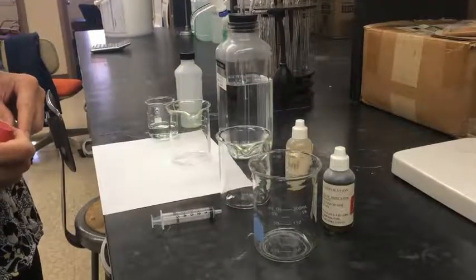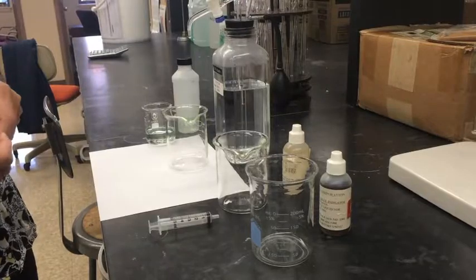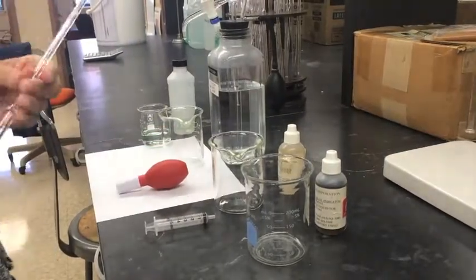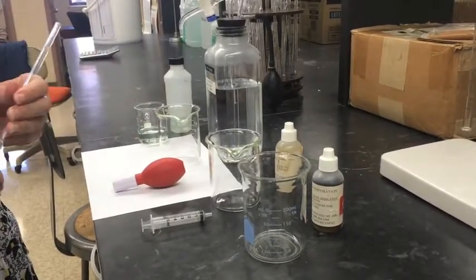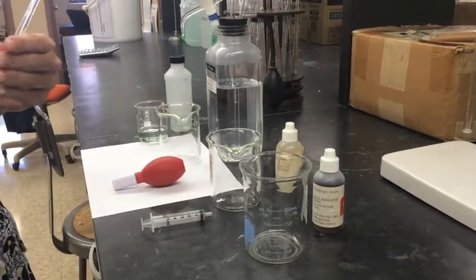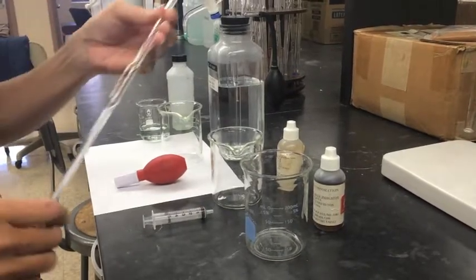We're going to demonstrate the titration for free and total acid on your FOSDIP 38 bath. First and foremost, what's important when you're doing these tests is to make sure that you get a representative sample from the bath. And once you collect that sample, you want to make sure that when you measure your initial sample size, you do it with the best accuracy possible.